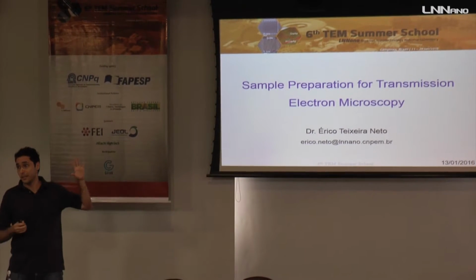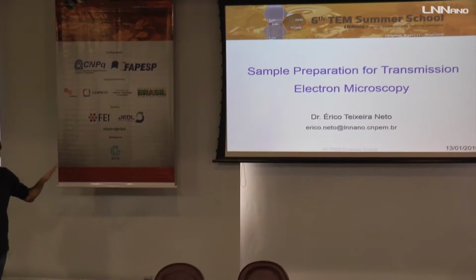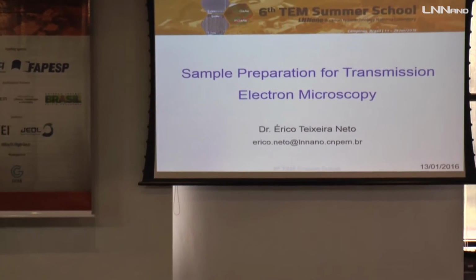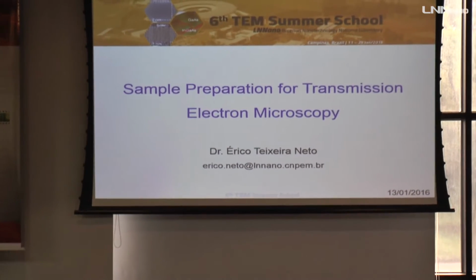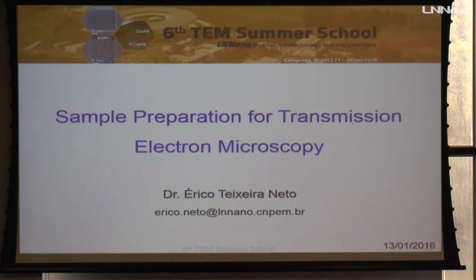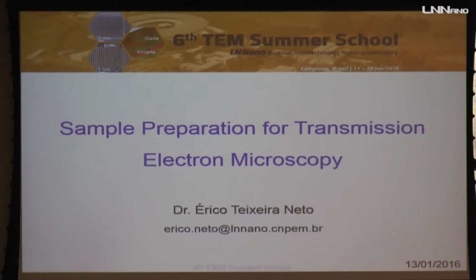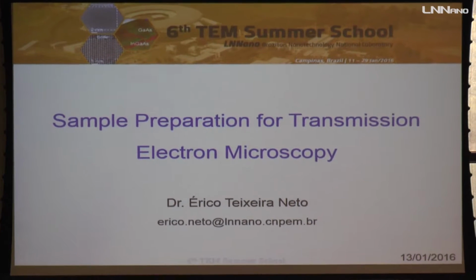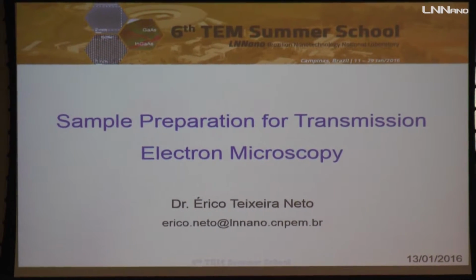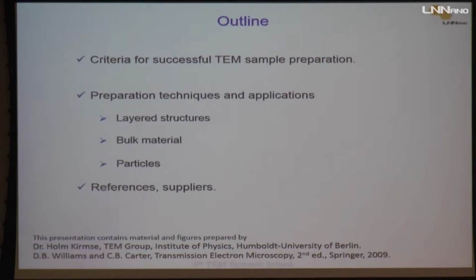But there is the need to put some effort in sample preparation to get good results. It's very important to keep it in your mind. It's not just all the theoretical understanding and practical understanding operating the machine, but also in sample preparation. This is fundamental to get a good result.